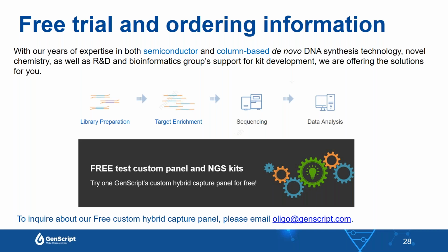So it is not a great fit for those sample types that are already short by nature. For example, circulating cell-free DNA, which is used in many non-invasive diagnostics. So for them, the tagmentation workflow is not the best fit.